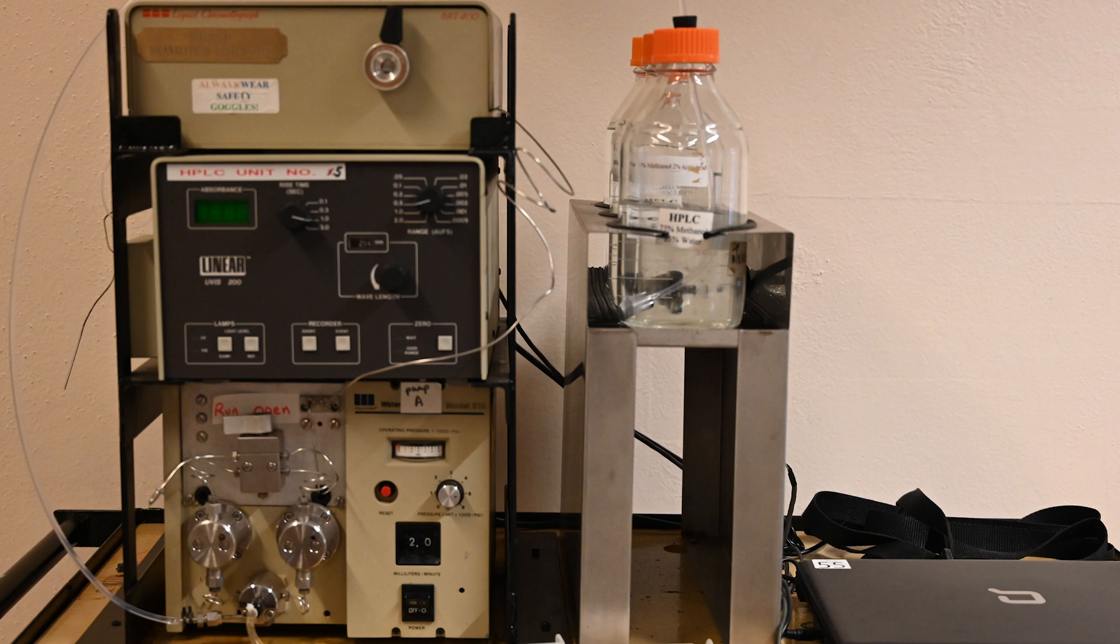HPLC can provide information on compound purity, concentration, and polarity. How it does this is by pushing a mobile phase through a stationary column. As that mobile phase carries the molecules to a detector, the molecules reach that detector based on the interactions between the molecules themselves and the stationary phase. The time it takes for the molecules to reach that detector is called the retention time and gives indication of what the molecules makeup is and its interactions with that stationary column.